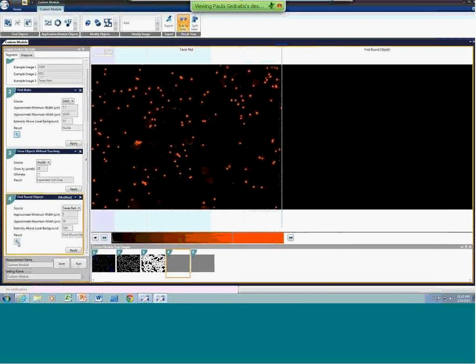I'm going to, again, click to find and click on individual beads. Okay, updated my settings here, and I'll just name these beads and click apply.